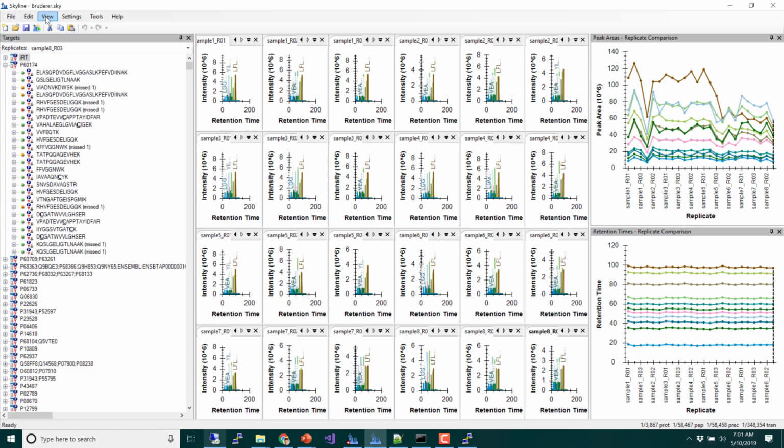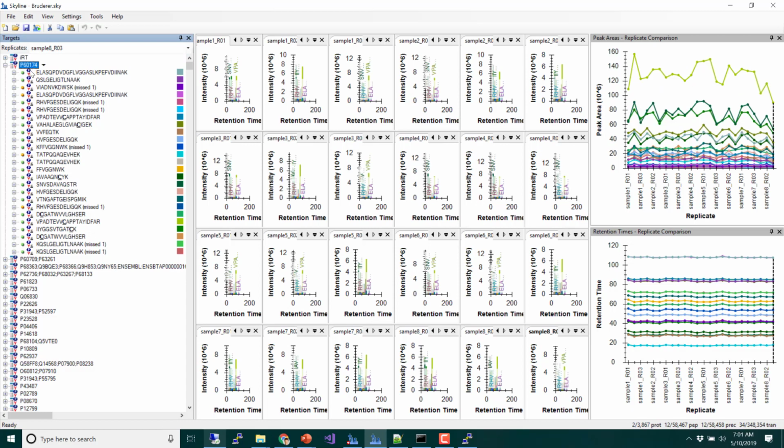The Buck Institute that now teaches one of these courses, they were the first place I went where they actually had 3 monitors, and they just stretched Skyline over all 3 monitors. Because Skyline is really quite fast. Actually, if you click on this, you can see that Skyline updates all those graphs pretty quickly, but they're really hard to look at.